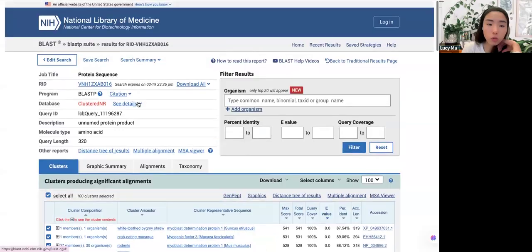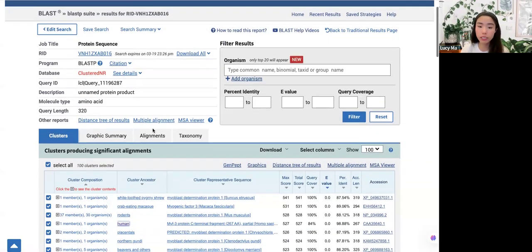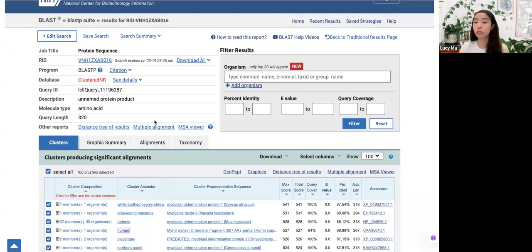So yeah, if you didn't know which protein your gene of interest belongs to or which organism it came from, this is a really good way to identify the source and the identity of your region of interest. All right, and that's it for the intro to Benchling and using the tools associated to help you identify a gene and translate to protein and the reverse process as well.